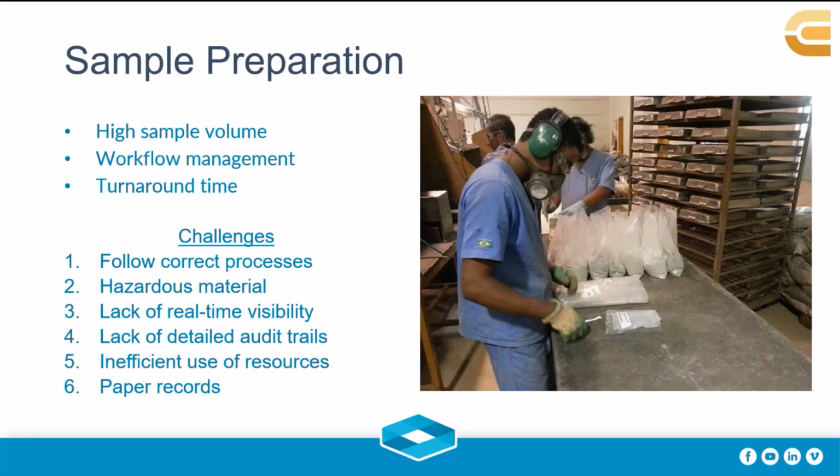For example, a person might crush the sample prior to doing a sizing, which is not ideal, right? So keeping track of the right processes is a challenge for each sample.